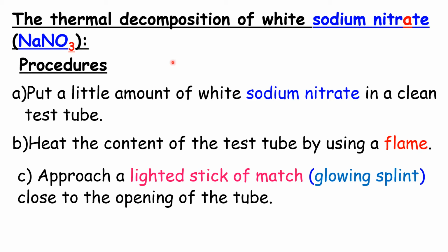The thermal decomposition of white sodium nitrate. ناخد بالنا ان nitrate which have the A letter، NaNO3 عشان ايه هناخد بالنا من حاجة دلوقتي. Procedures. Put a little amount of white sodium nitrate in a clean test tube. Heat the content of the test tube by using a flame.